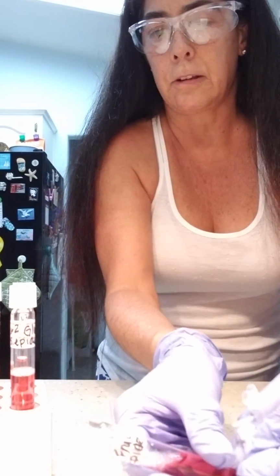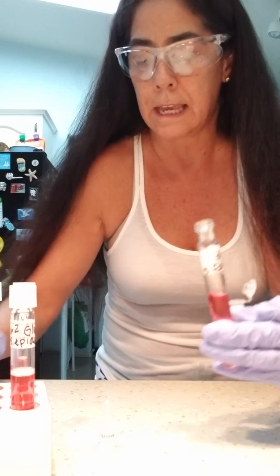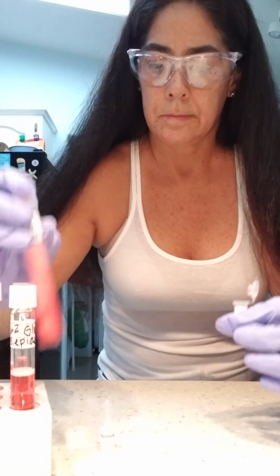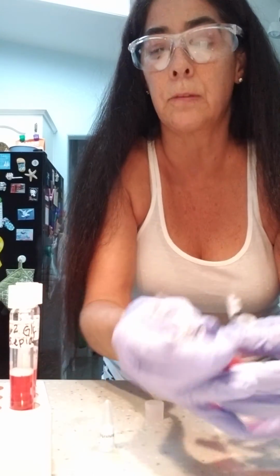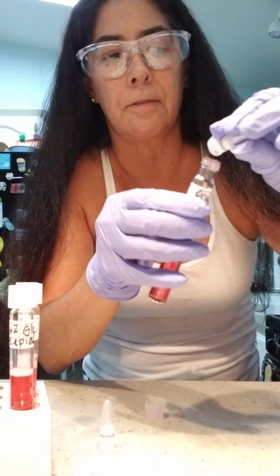Okay, and I'll sterilize the top again, and then I'm going to close it, shake it up, and then I will be pausing this and taking these off and sterilizing the tops again so that we can add the drops and the Durham tube. And once we do that, then we are going to wait for 12 to 18 hours to see what formulates in our vials. So that video will take place in another day or 2. And today is October 2nd, if I didn't say that before.